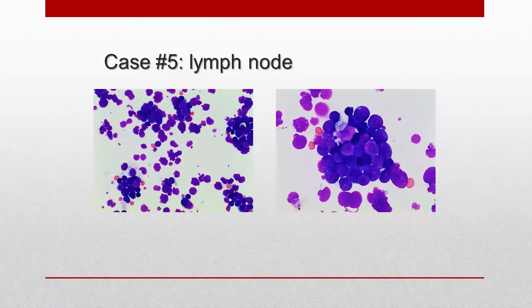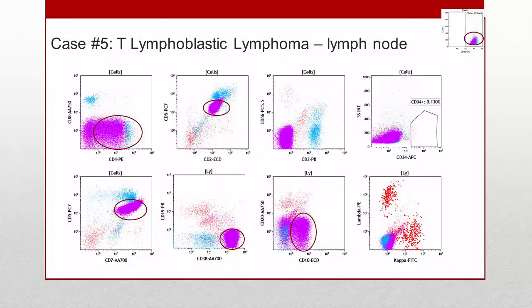When you look at the lymph node itself, you can see here a scattering of cells. When you go in, you can see these clusters of cells that are sort of sticking together, but they're all dark blue, with very little cytoplasm within them. Again, all 4 tubes are run. However, this is actually a lot smaller on the screen up here.